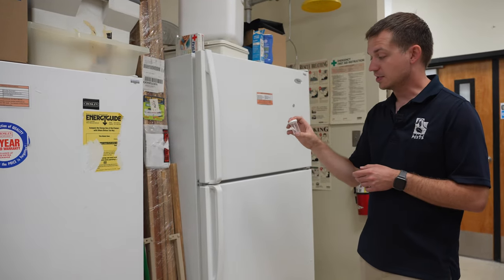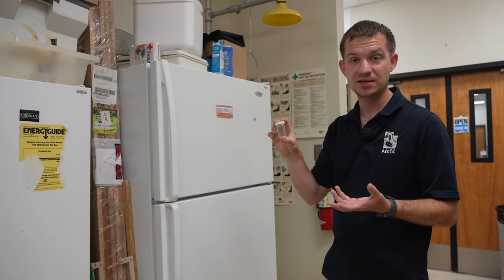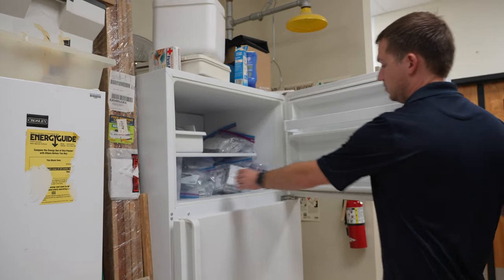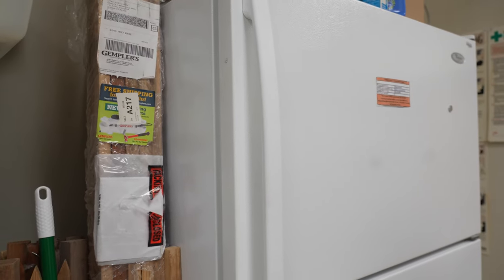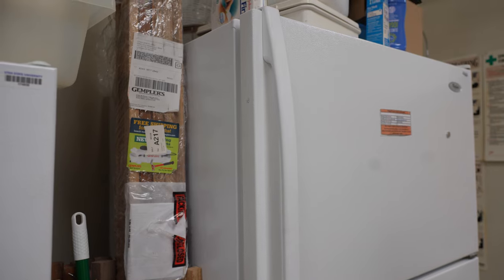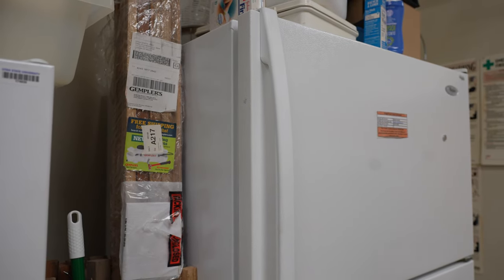When you collect an insect outside and have it in a container, the best and most humane way to kill it is to simply put it in your home freezer for about 24 hours. Then you can either submit it dead in a container with paper towel, or put it in a container with ethanol or rubbing alcohol.